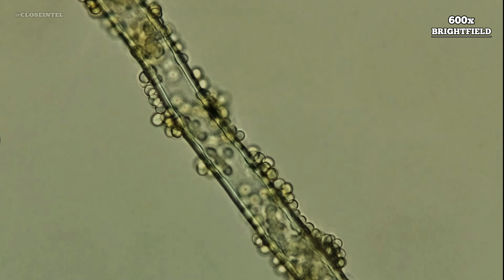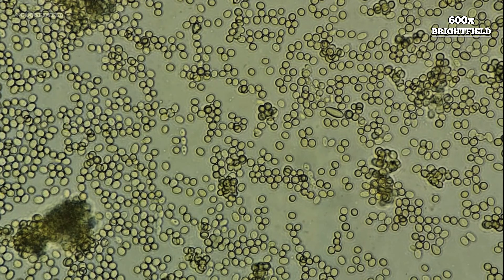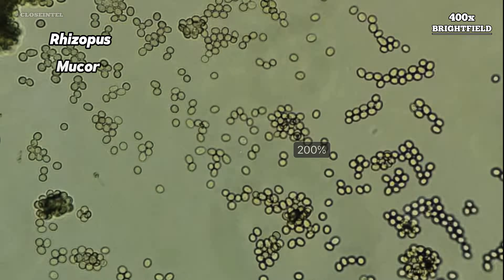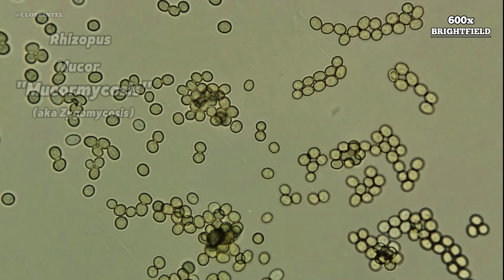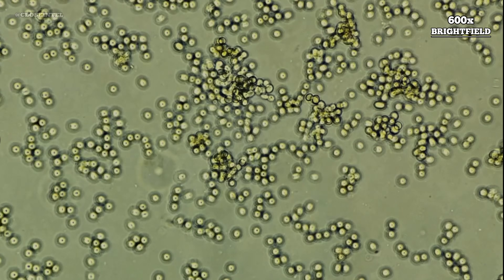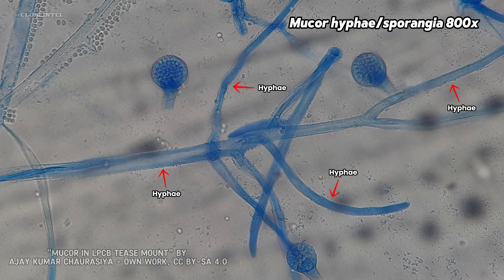While these spores are microscopic and primarily designed for reproduction, they can still pose a risk if inhaled or if they enter through an open wound. Certain species like Rhizopus or Mucor are known to cause mucormycosis, a fungal infection where spores can invade tissues, then germinate and develop into hyphae.